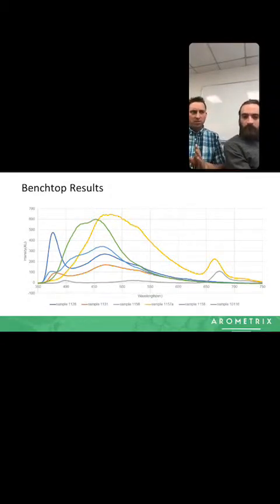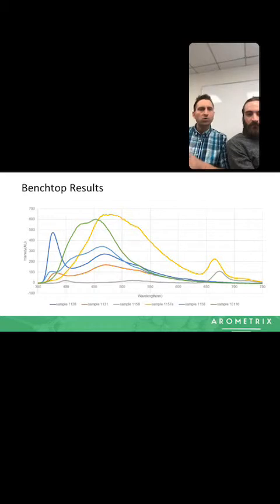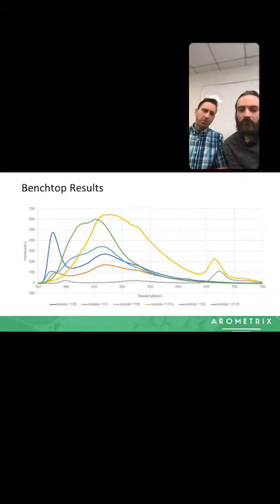But there was still a big question mark at this point. While we have all these extracts and distillates, they're still very complex solutions. They are not individual compounds. And so it was very hard, even with the 20 samples, to really come down and get a good idea of what was causing this signal. So what we decided to do was start to target specific compounds, and Kenneth's going to talk about how we did that here.